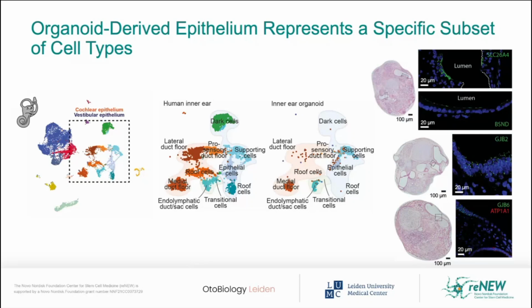However, we also had to talk, of course, about genes that actually lead to hearing loss. So we looked also into protein expression of genes that are known to contribute to hearing loss or vestibular disorders. And you can see that these are nicely expressed if you look at parts of these vesicles. So this makes the model a potential model to mimic genetic hearing loss.